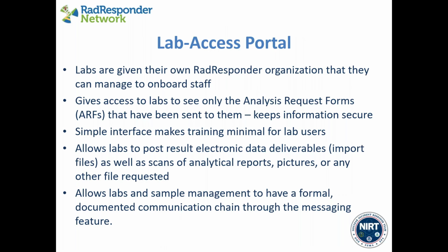It all starts with this lab access portal. This is a new part of RadResponder that we developed to give labs a place to go to post or retrieve their analysis request information and post their data. It's a special access portal into RadResponder where the labs are given their own organization where they can manage their own staff. They can add more people to help do the data reporting, and they will all have their individual username and password so it can track who's in the system when. It only gives the labs access to the analysis request forms that have been sent to them and keeps all the other information secure on the full RadResponder side.